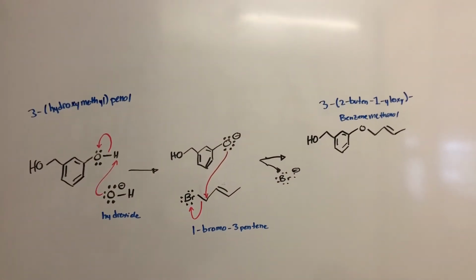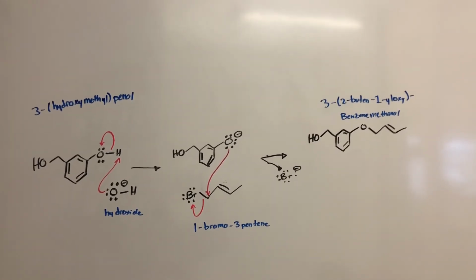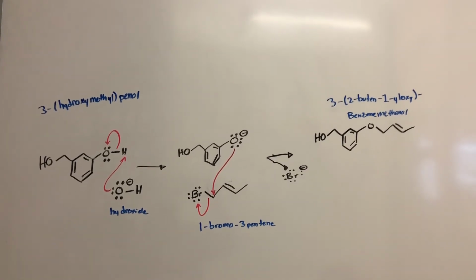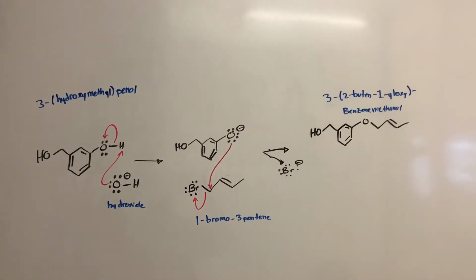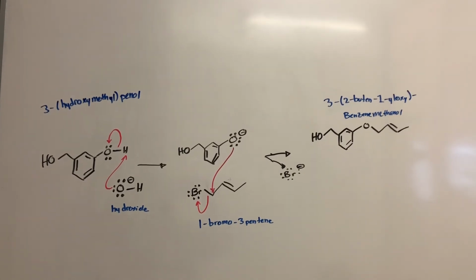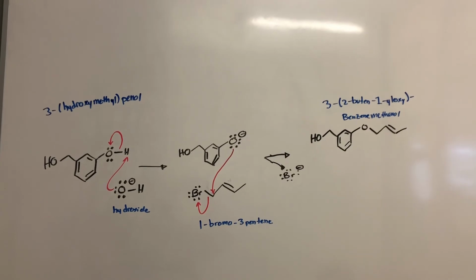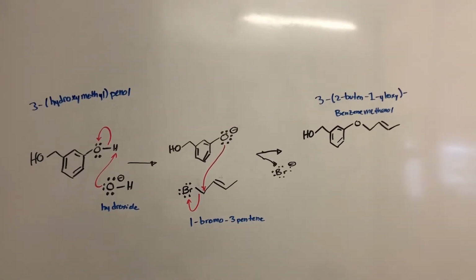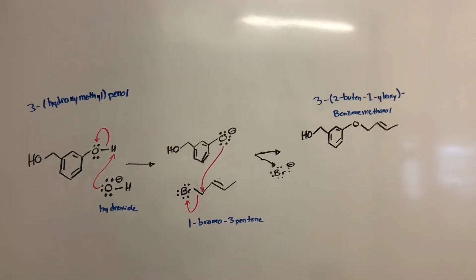To determine an appropriate reflux period, a TLC plate test can be used during refluxing to identify which compounds are present at that moment of the reaction. After applying your sample to the plate and waiting the appropriate time, you can examine your results. Multiple spots would mean a longer reflux period is needed. If the test comes back with 1 spot, a shorter period may be needed. The TLC plate is useful as it allows us to determine the purity of the sample by identifying the compounds that are present.